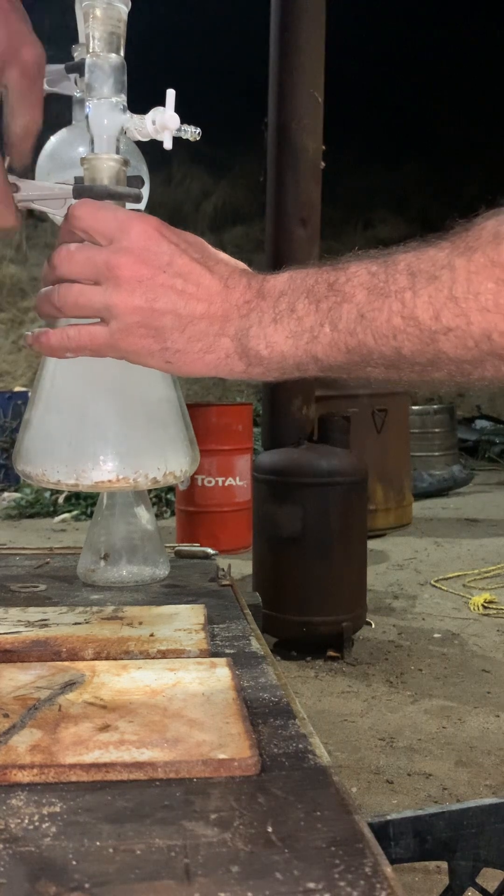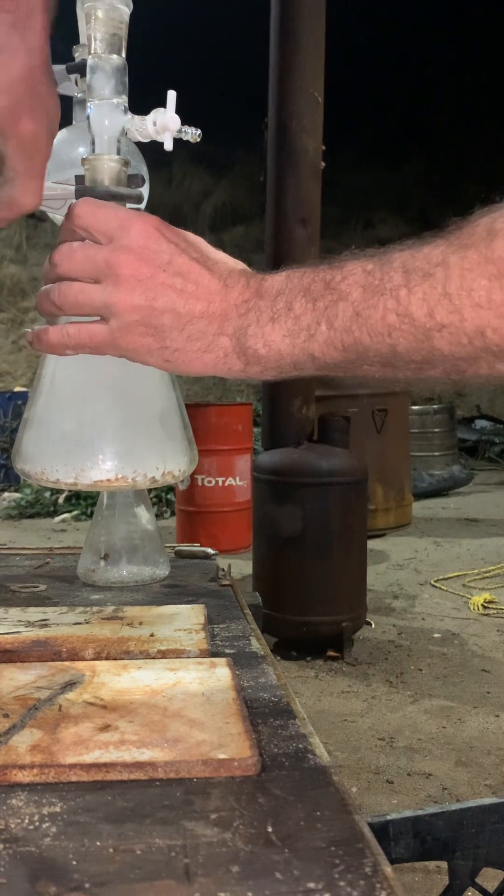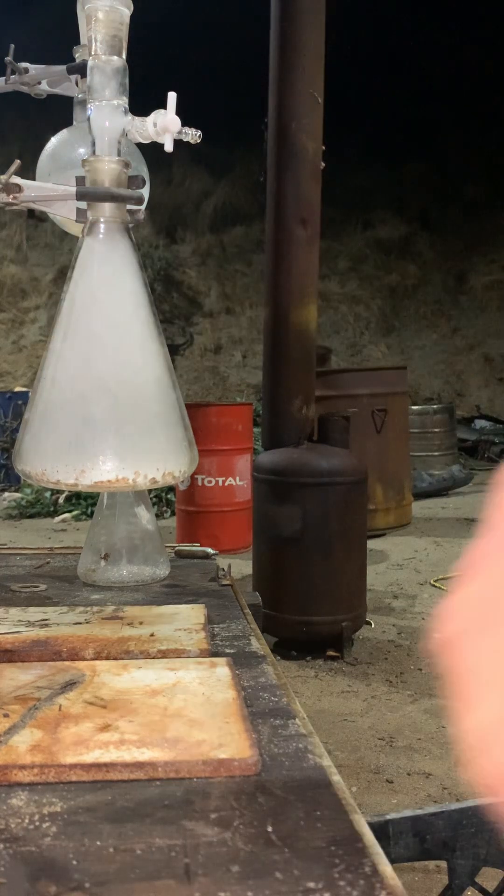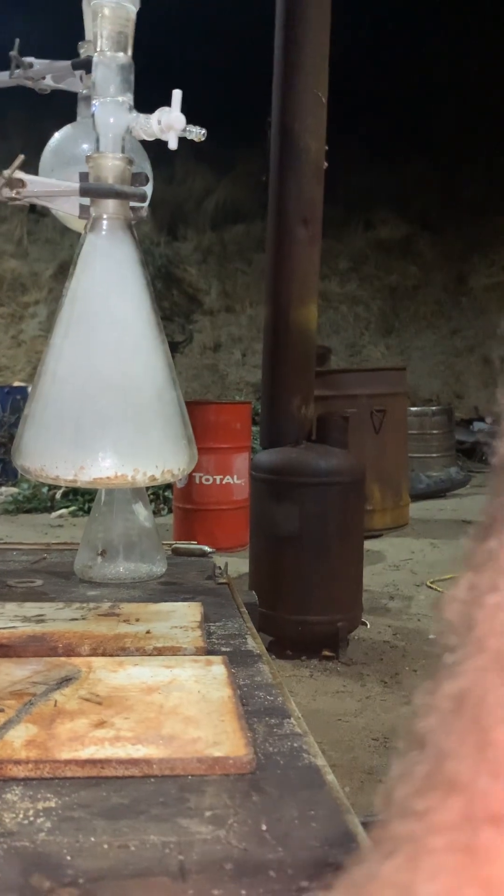So it smokes like hell. Anyways, just thought I'd share that with everybody. I haven't read anything about this on Google.